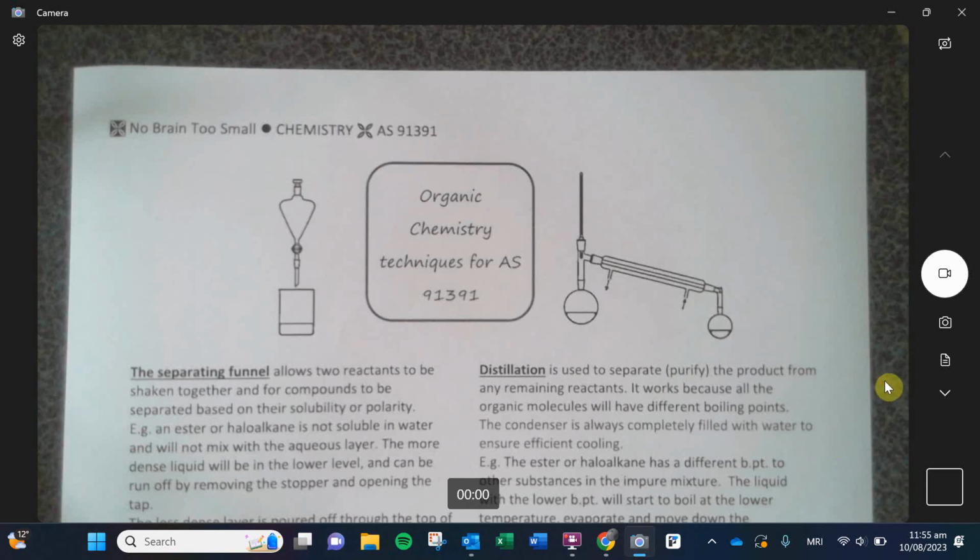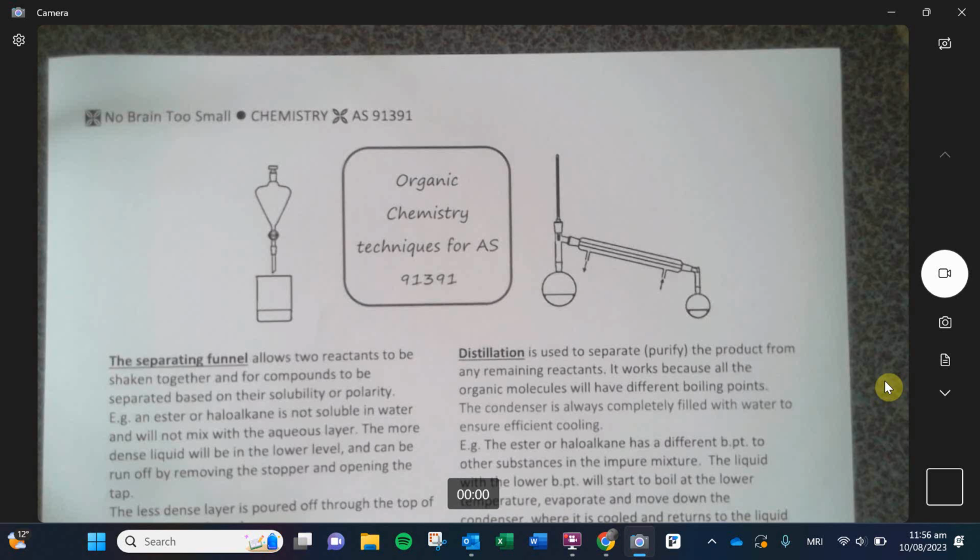All right. So, moving on to the organic chemistry component of the attractive forces. The stuff we just talked about previously ties into organic chemistry because it will explain which type of equipment you want to use depending on the procedure. I've given you this summary sheet because I think it's really good, and there's no point in you writing down lots and lots of stuff.